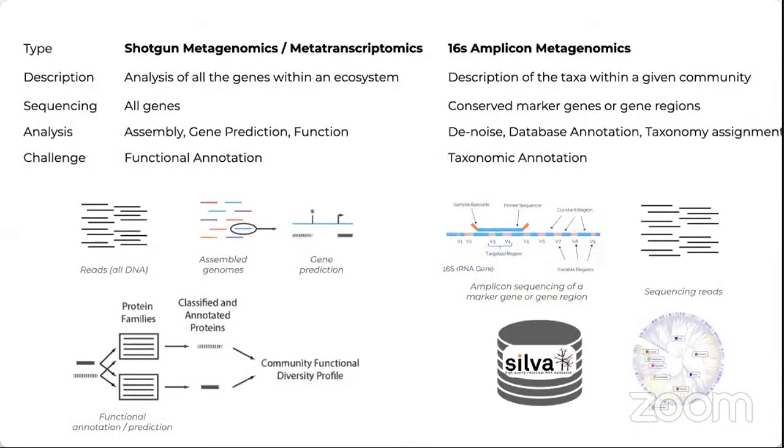So in general, when we discuss these different technologies and methods that are used to characterize metagenomics and microbial populations, we have shotgun metagenomics and we have 16S metagenomics or amplicon sequencing methods. Shotgun metagenomics or metatranscriptomics will focus on understanding all of the genes or the whole genome of the microbes, and with the help of general genome assembly of these several different microbes, we can get key insights into their functional contribution in maintaining the balance and in helping us with the processing of the metabolites.